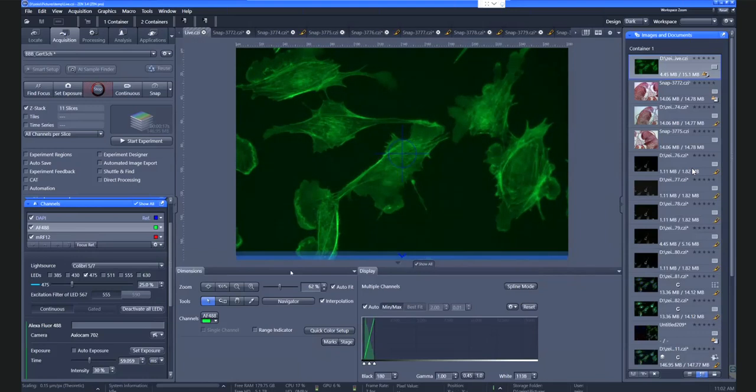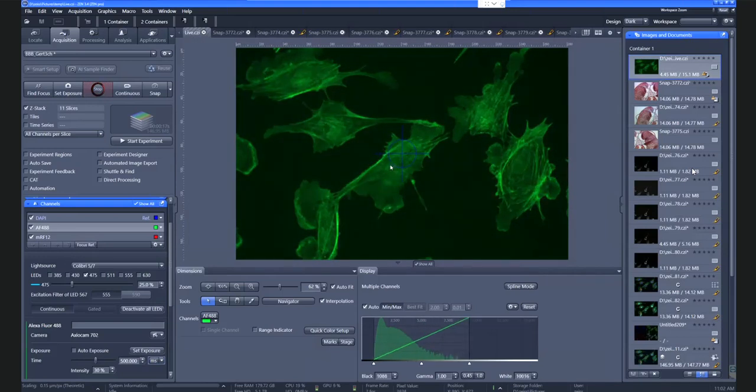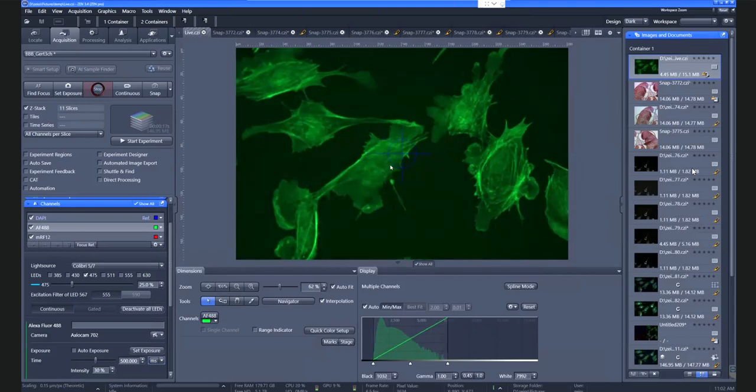Let's say we would do some with this very 60 milliseconds exposure. Let's again do 500 milliseconds exposure. The image looks much better. And live still gives me a quite easy update, and I could move my sample and it really looks like a live image.